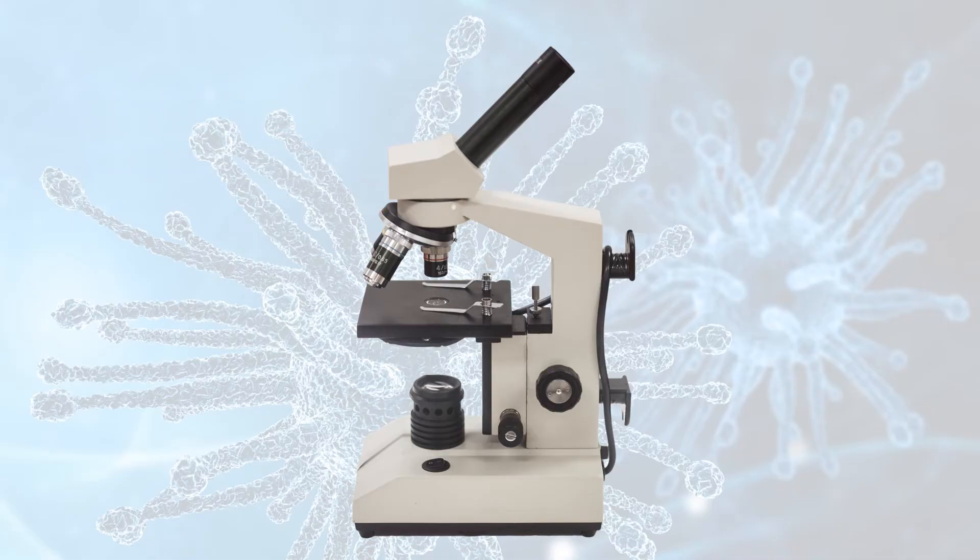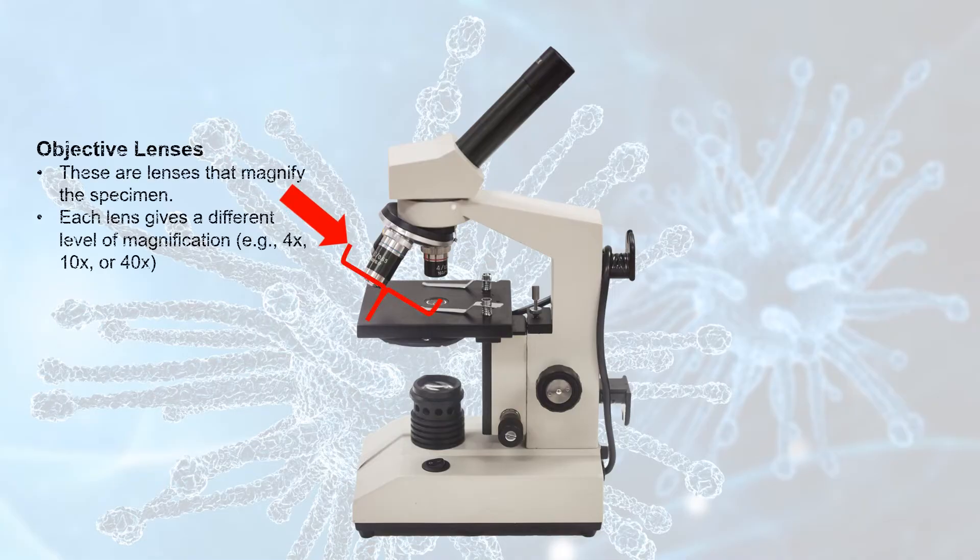Since I just mentioned them, we may as well talk about the objective lenses which are found under the revolving nose piece right here. These are lenses which magnify the specimen. The microscopes in our science lab have three objective lenses.